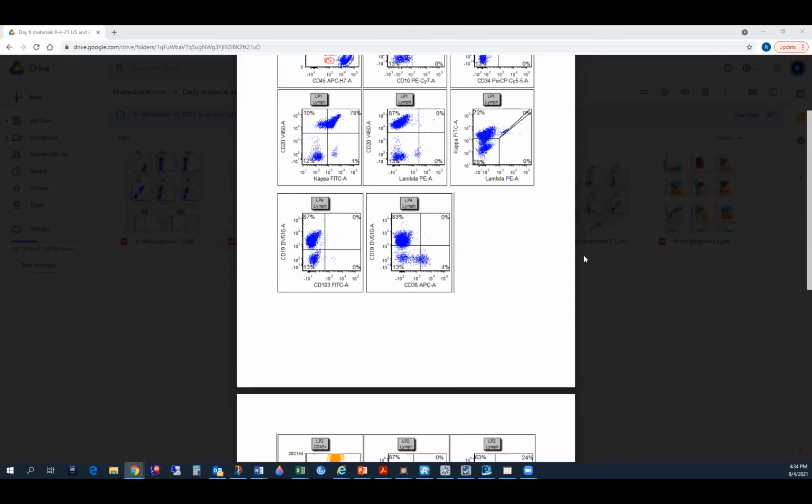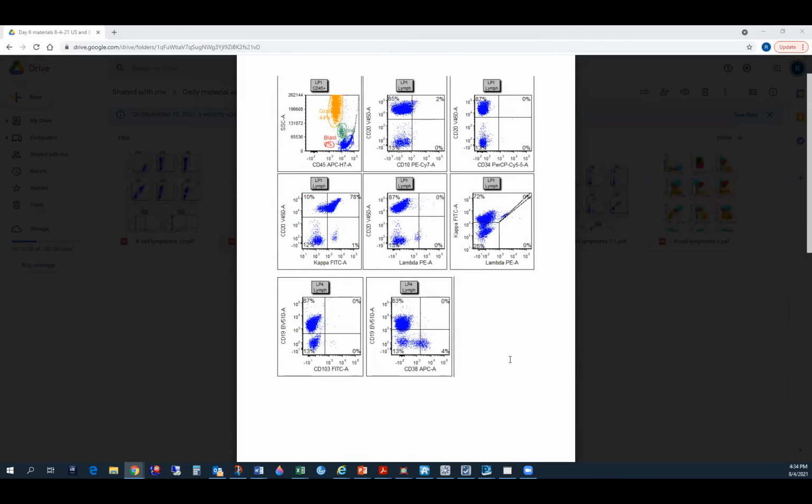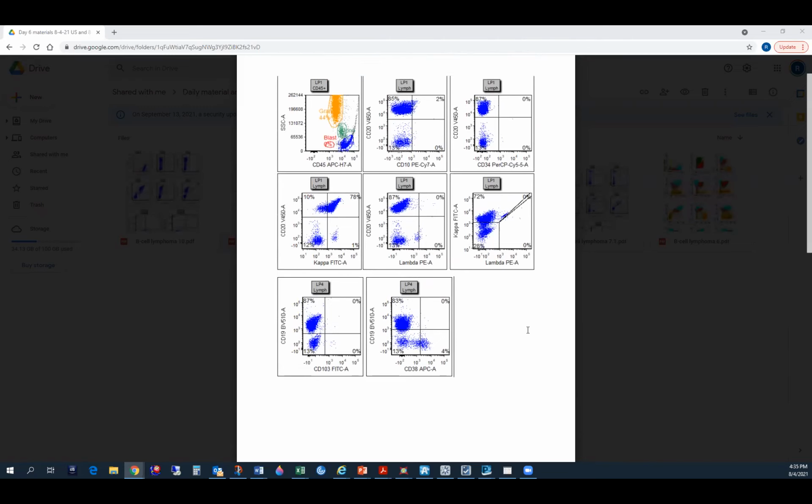This thing that is negative for 19, it is blue in color, so it was here. Or the artifact, it is here. And it's showing in 38, right? Is it plasma cells going somewhere? Plasma cells should have CD19 too, right? It could be dendritic cells. Okay, I'll answer that.